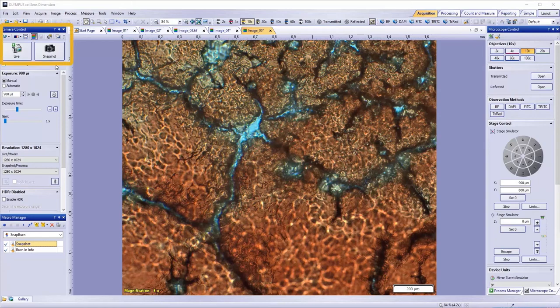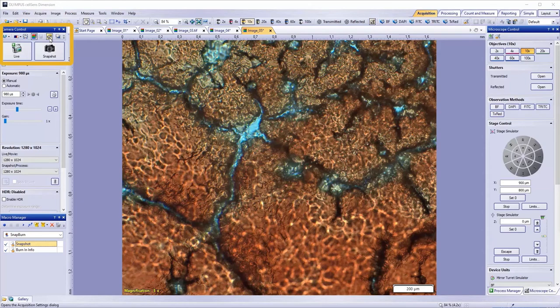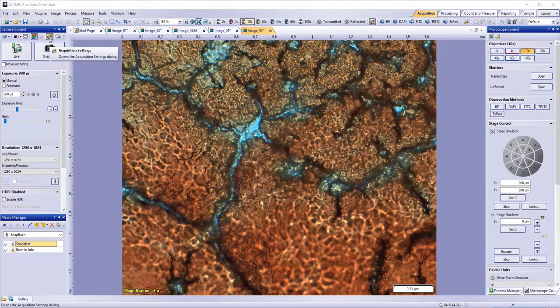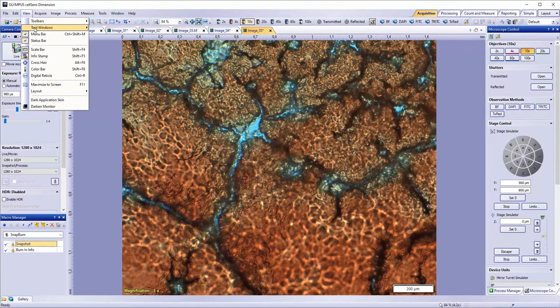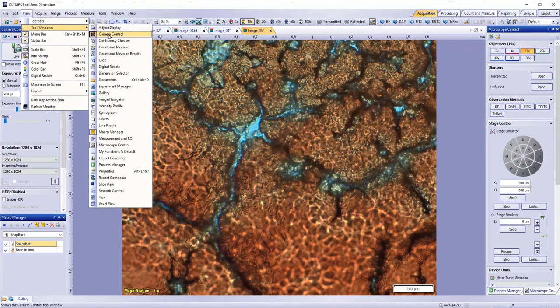Click on the icon that looks like a video camera with a hand on top above the Live and Snap button in the Camera Control Tool window. This will take you to Acquisition Settings. If your Camera Control Tool window isn't visible, click View, Tool Windows, and Camera Control.